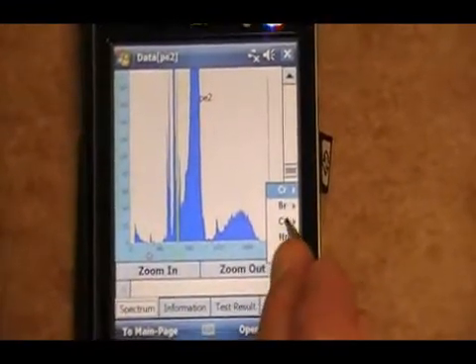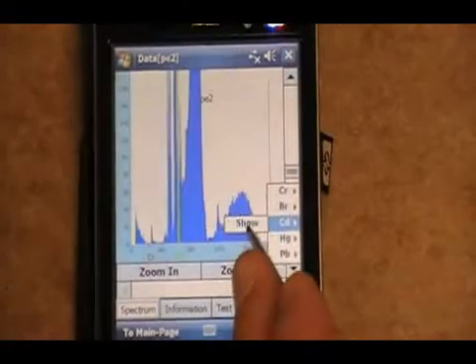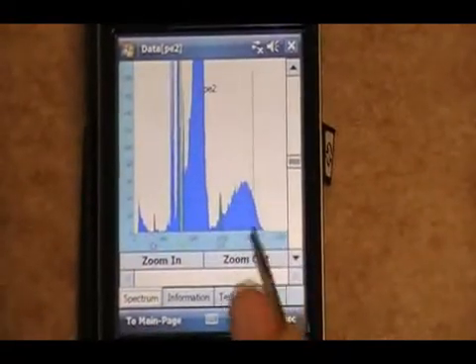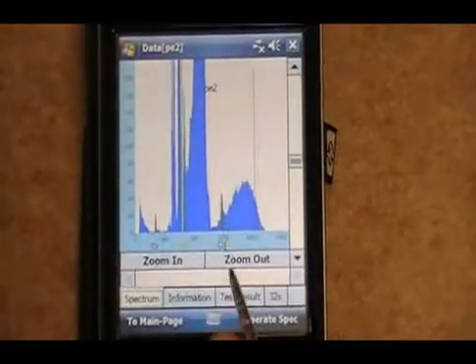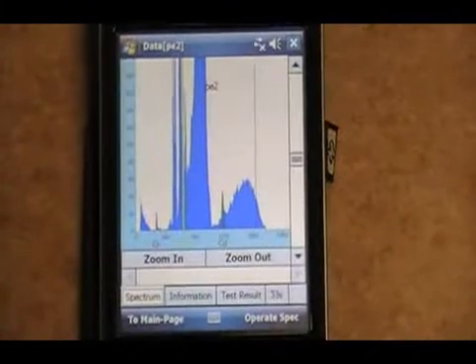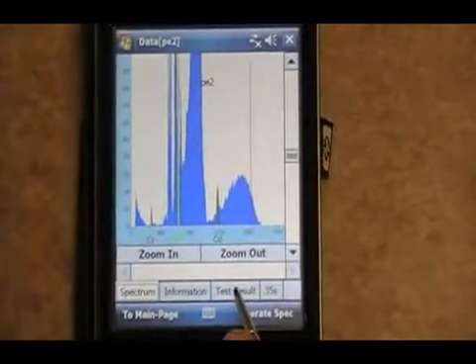So we'll put the cadmium. And that comes up right here. You can see that peak fairly well. And from here, we can click back to the test result.